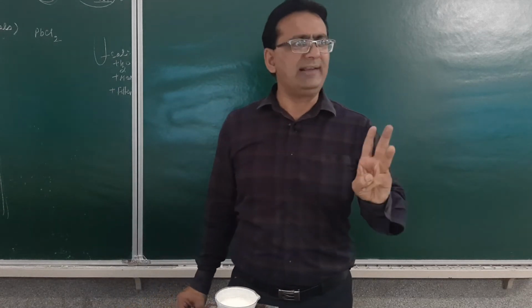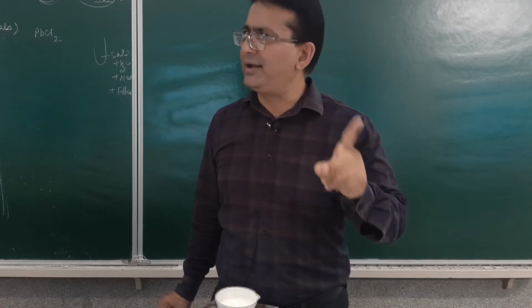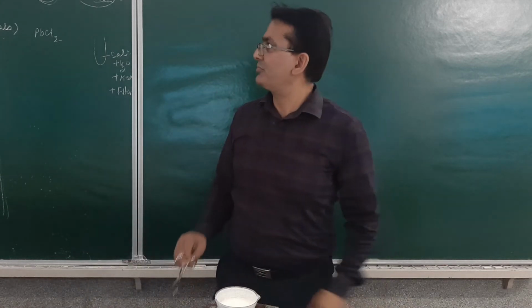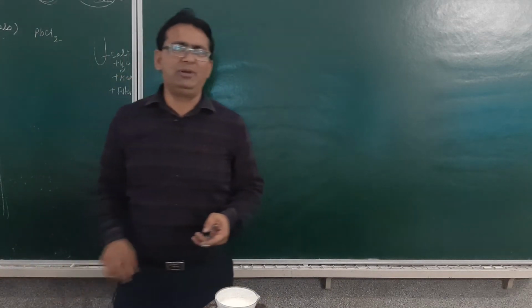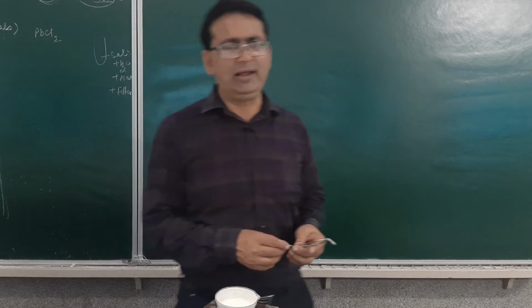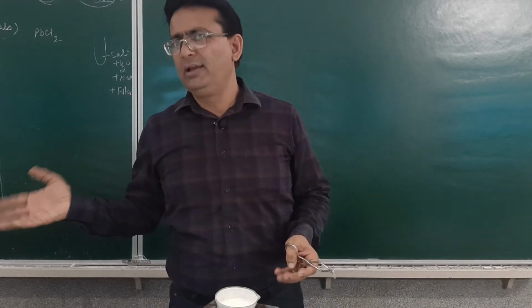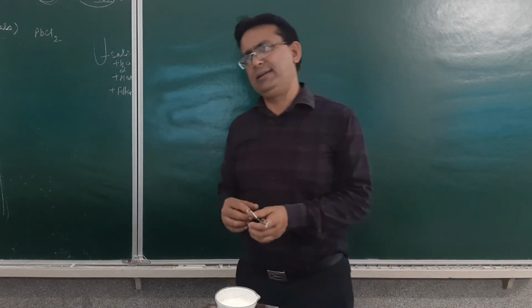You have 3 hours. In 3 hours you have to do a titration, you have to do the organic analysis, and you have to do the mixture and the salt analysis. So a better word here, instead of writing mixture analysis, would have been salt analysis. Am I clear? Mixture would be when there is mixing of 2 or more salts. Since over here it is only 1 salt, it can be better called a salt analysis.